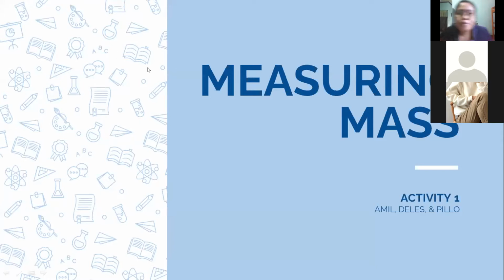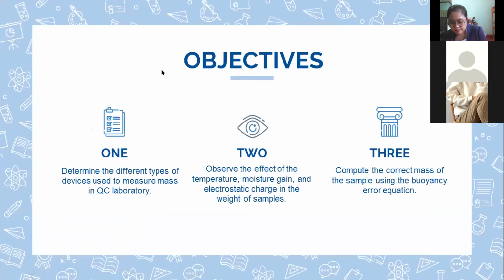So, we are group 1 and we will be discussing to you our lab activity yesterday entitled Measuring Mass. Here are our objectives.